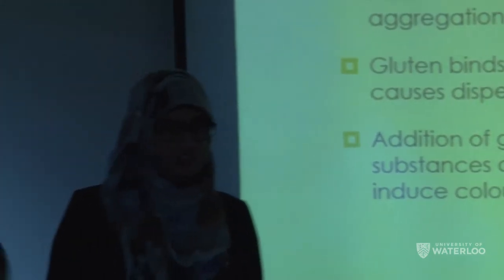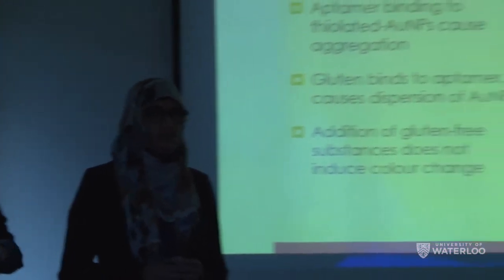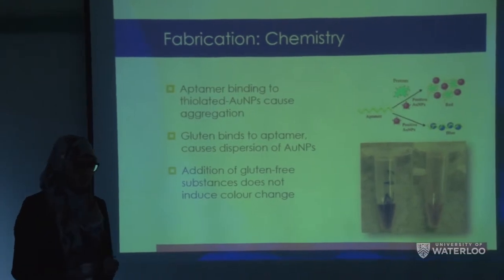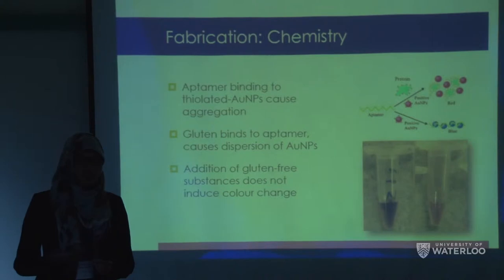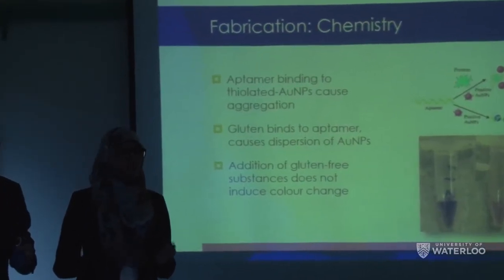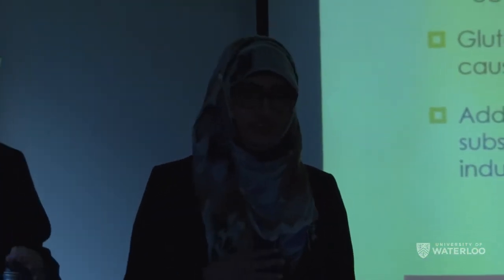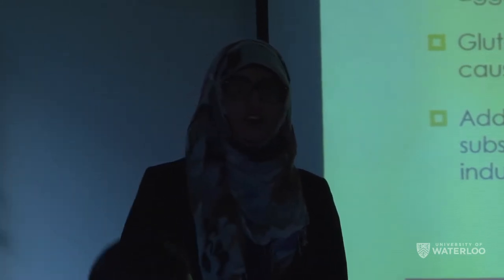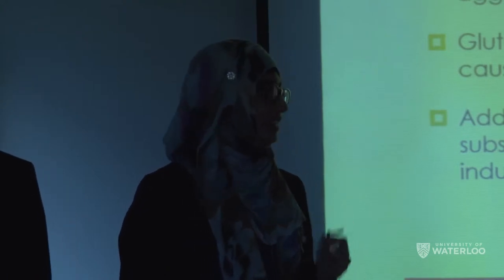The underlying chemistry of our sensor takes advantage of gold nanoparticles' inherent color-changing ability with respect to aggregation versus dispersion. We use this property to create our colorimetric assay. The thiolated gold nanoparticles are able to bind to the DNA, or the aptamer, and this causes aggregation and makes the color change from red to blue, as you can see in the top picture. Then, if you add gluten to the sensor, the aptamer will bind preferentially to gluten, and this will cause dispersion of the gold nanoparticles and change the color from blue back to red, again seen in the top picture.